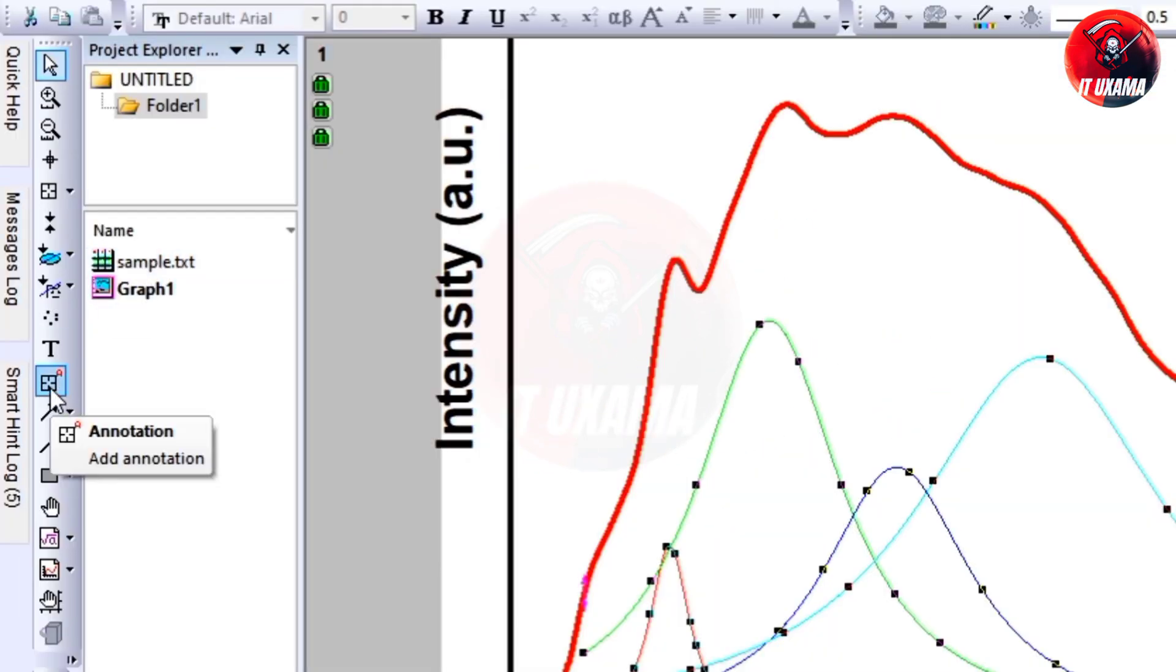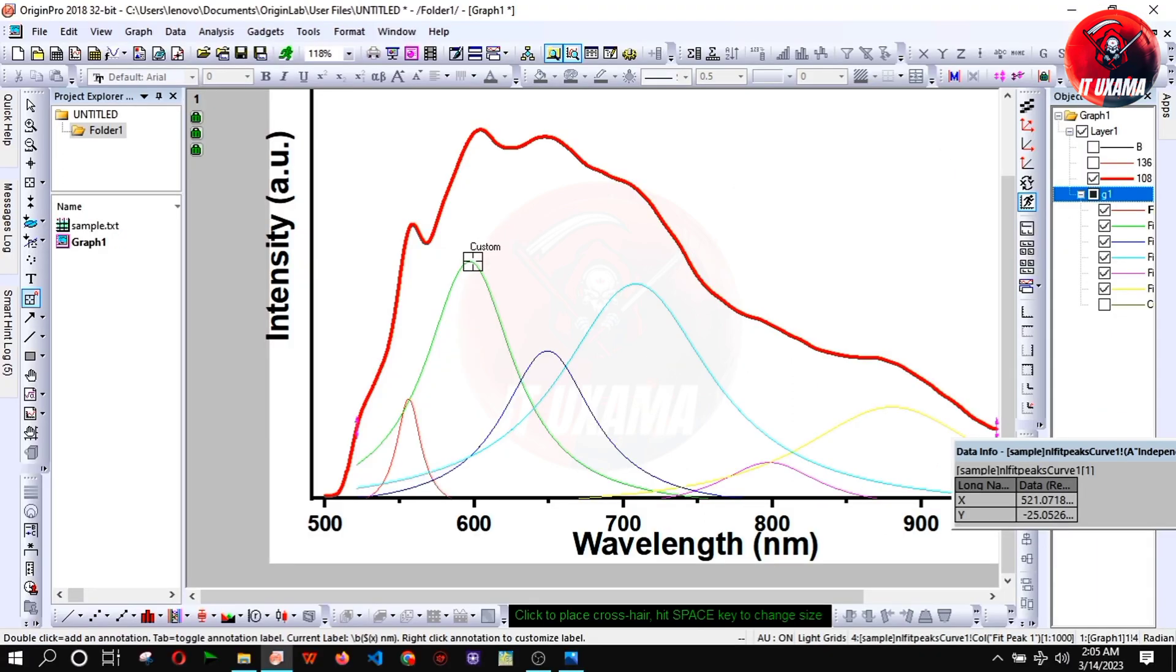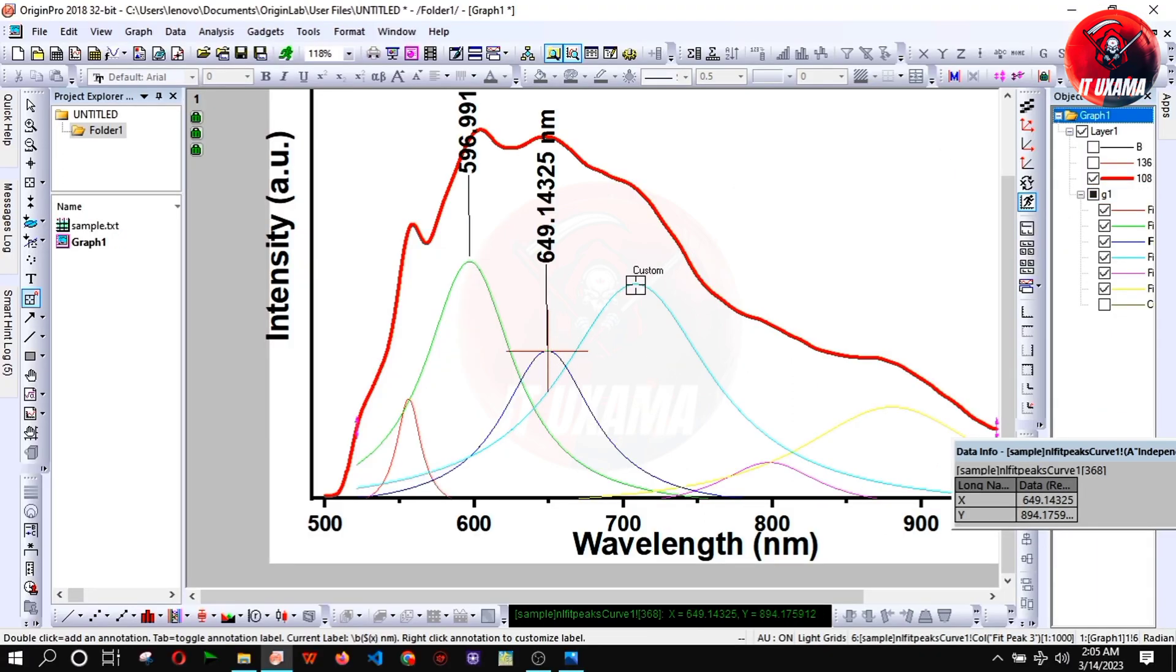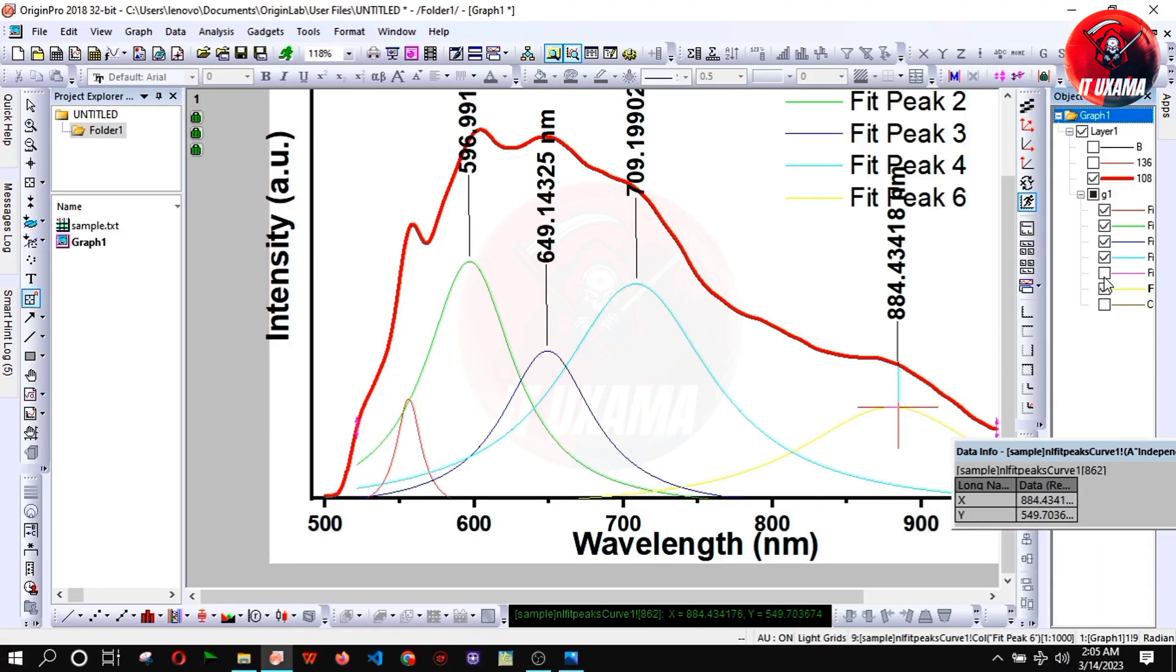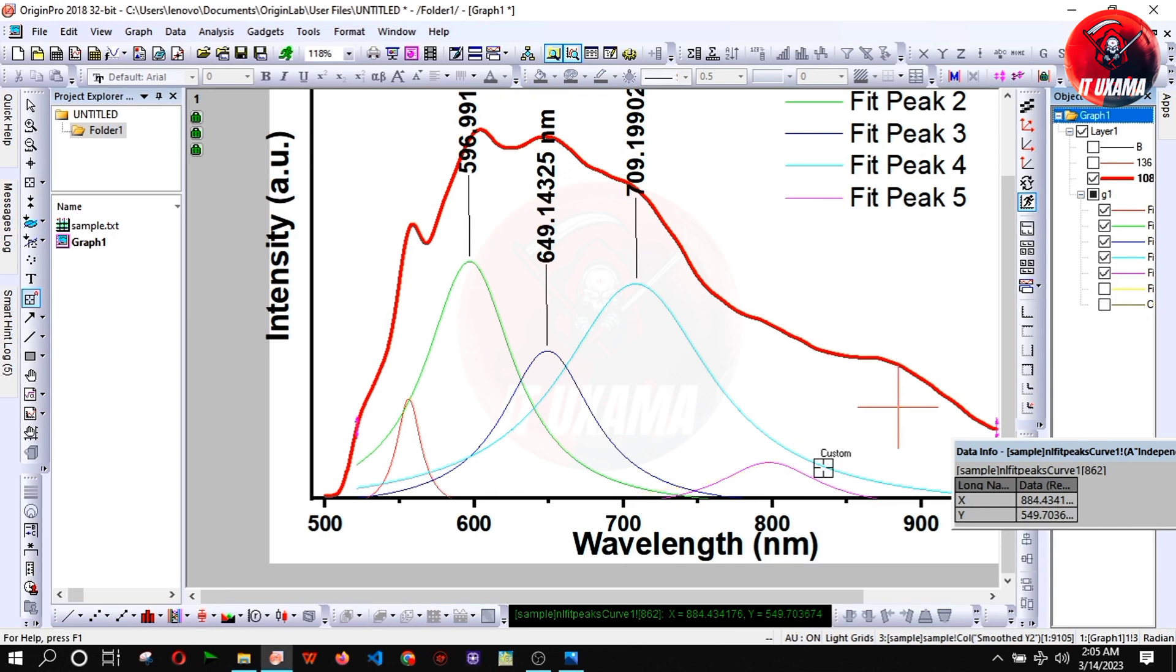Now add annotation. You can hide overlapping peak to add annotation.